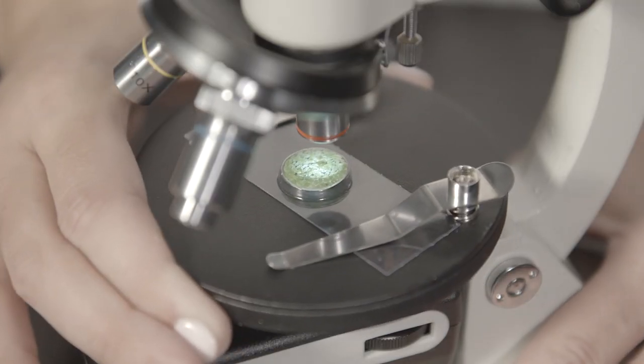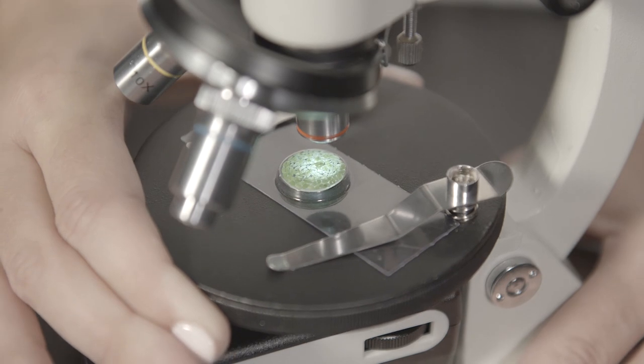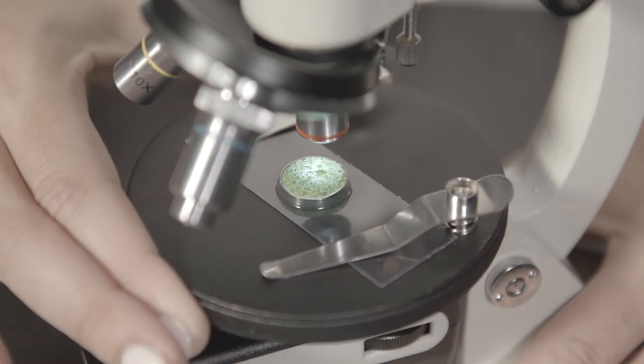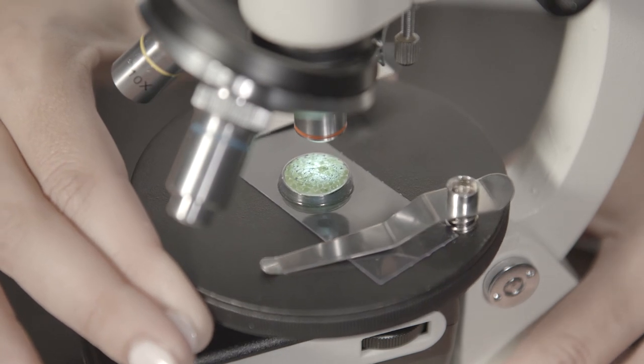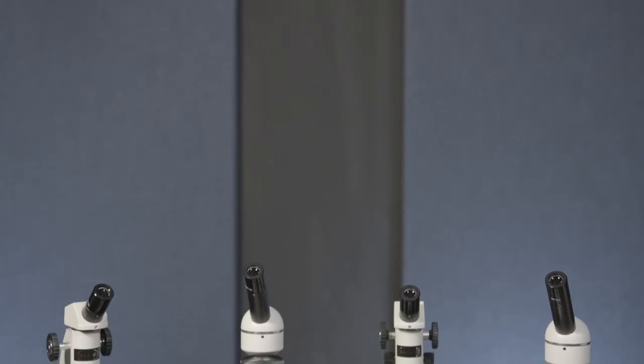Rather than a 5-hole disk diaphragm, these elementary-level cordless microscopes use a floating stage. The floating stage is easily movable in all directions for simple slide scanning by younger students.